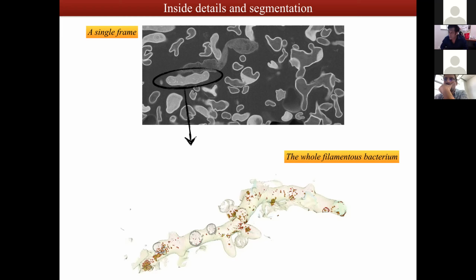And then we will do a soft blot that I've shown you in the last couple of slides, and then we will plunge it into the liquid ethane. Then we'll follow the whole procedure. However, you can stain your sample, but that will not be a cryo sample. There are other methods where you can stain your sample for a longer time, and then you air dry it and use it as a regular fixed sample, like chemical fixation or something. All right. Does that answer your question, Daniel and Juan?